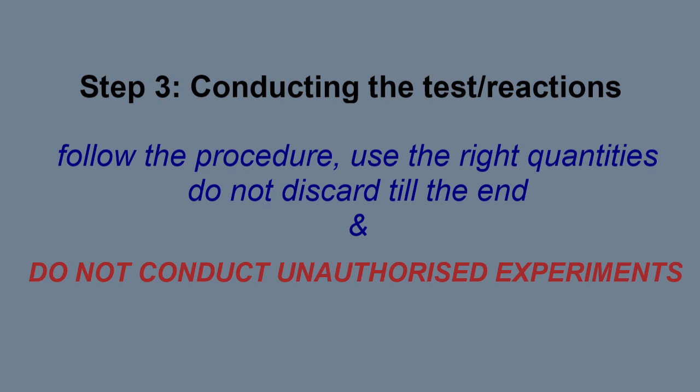This is important since some reactions are slow, and thus, the initial and final observation may be different. In such case, record all the observations. The last and important rule 4. Do not attempt unauthorized experiments.